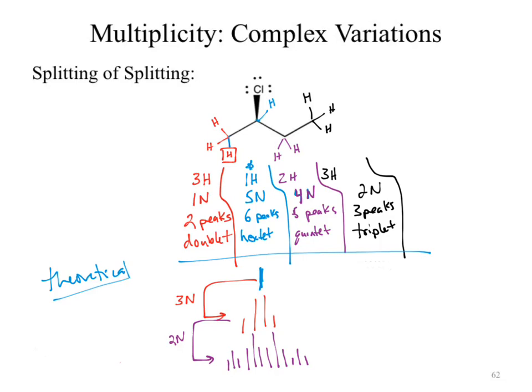What do we end up seeing? Well, the visual result is what we summarized already, which was 6 peaks. I can count. Did I count that right? Yes. There's our 6 peak signal. How did we go from this big, nasty, ugly thing to a relatively nice, organized 6 peaks?